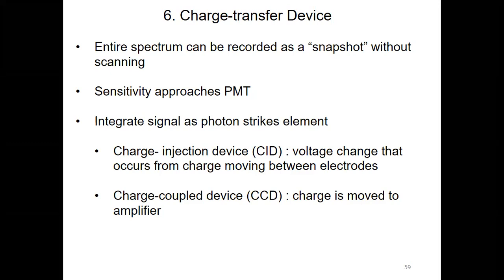So if we use this diode array for those types of time-dependent spectroscopic measurements, then within 1 second we will get the spectrum. If we are interested in lambda max, we will be able to determine the intensity or the absorption at the lambda max, right? And within 1 second, we will get the spectrum. And if we need it every second, we can get a spectrum using the diode array.